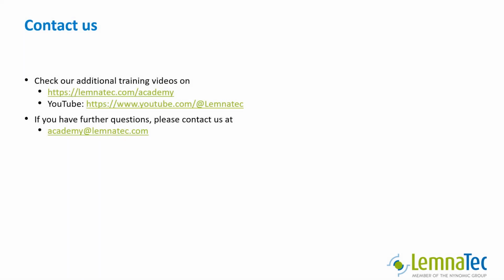This was the last video on root analysis with LemnaGrid. Feel free to ask us if you need further assistance. In the final video of the series, we will discuss some special considerations we need to take into account when we create analysis definitions based on the grid we created in this mini-series. See you there.